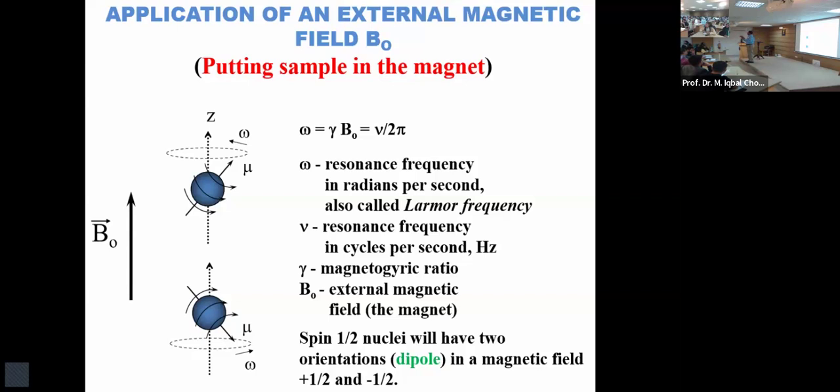The protons are not the same. Protons have different electronic environments. They have a shielding of electrons around them, some more, some less. The one next to an electronegative atom would have fewer electrons around it, and the one without any electronegative atom would have more electrons around it.